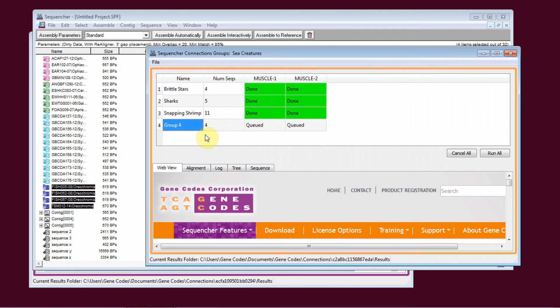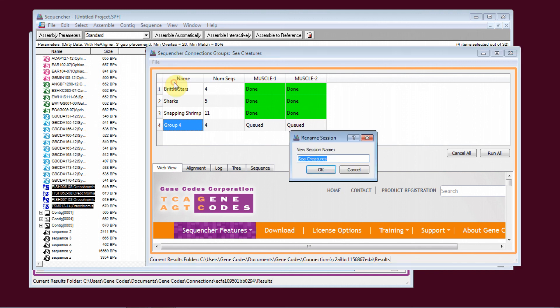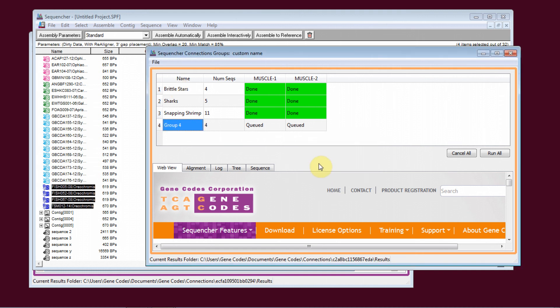Each session can be given a custom name. In Connection Sessions for groups of sequences, you can now change the name for the group.